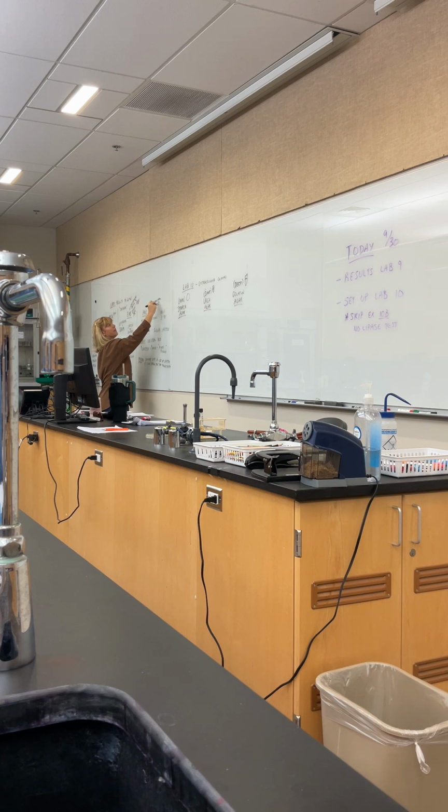Crystal violet is a dye that can be in the media, and this dye is going to inhibit gram-positives. So if I'm a gram-positive, I'm not going to be able to grow on this plate at all. So no gram-positive organisms.